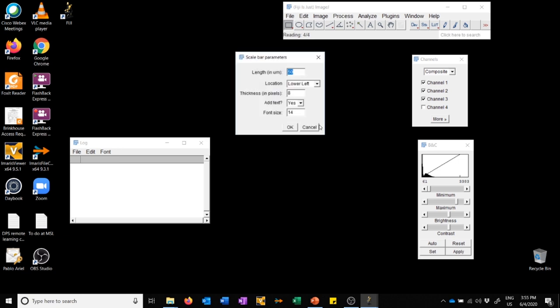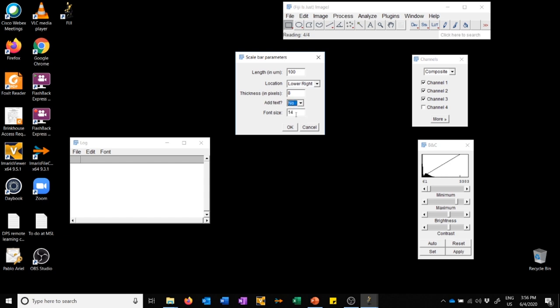Finally it asks me, since I said I wanted a scale bar, what are the parameters? I'm going to modify this so that it's a 100 micron scale bar. I'm going to change that to lower right corner. I don't want any text, I'll put the text in the figure legend. So I'm going to say OK.